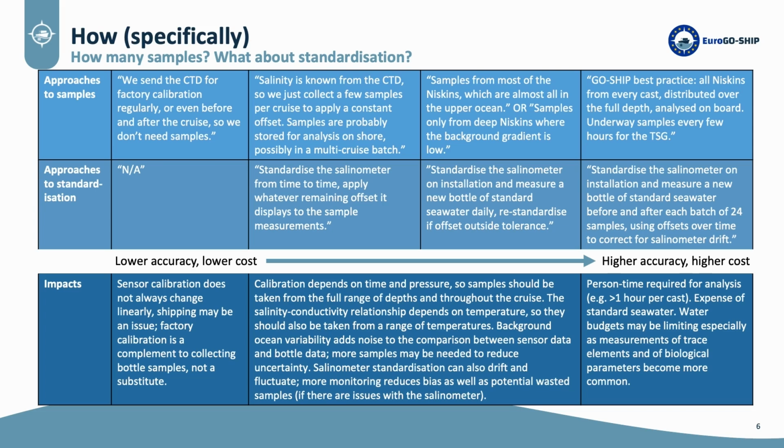And you might also monitor the salinometer standardization a few times or daily as you're running the samples, in case it needs to be changed. So this is going to improve the data quality, but if you're not getting the full depth range, you're still missing important information because of the pressure dependence of the conductivity calibration.